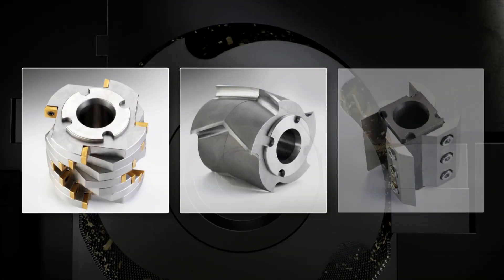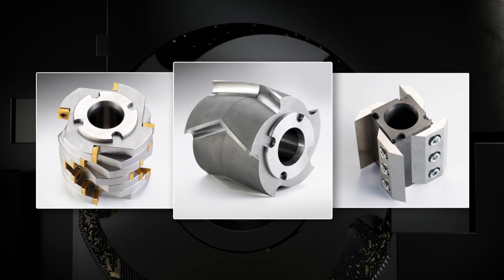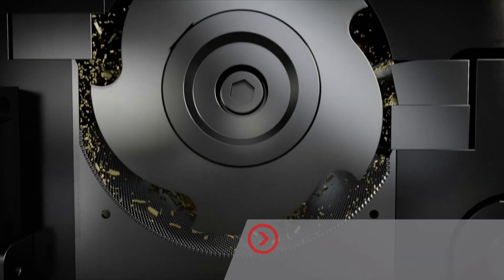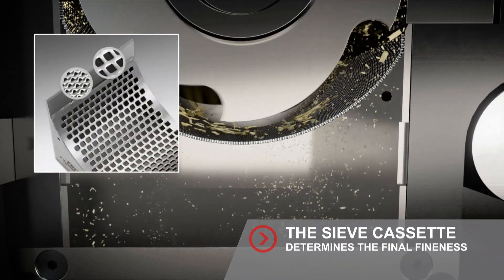For each application, the perfect rotor. For example, the standard rotor with V-cutting edges for especially tough elastic materials. The choice of the utilized sieve cassette determines the final fineness of the sample.